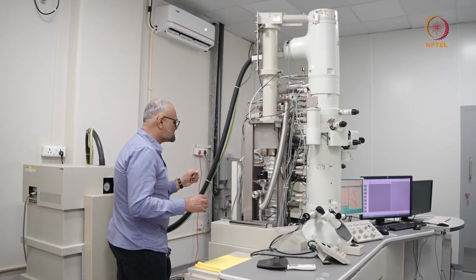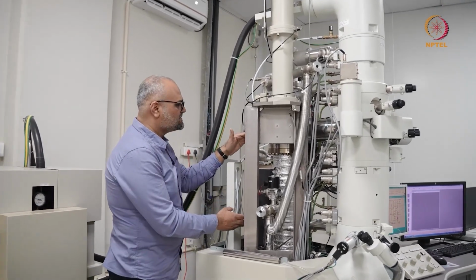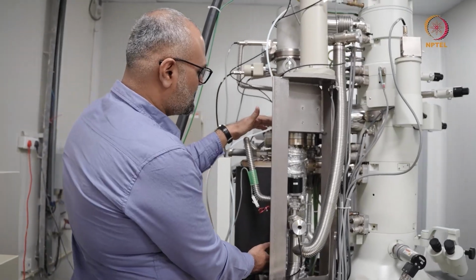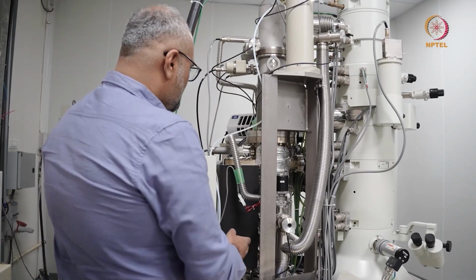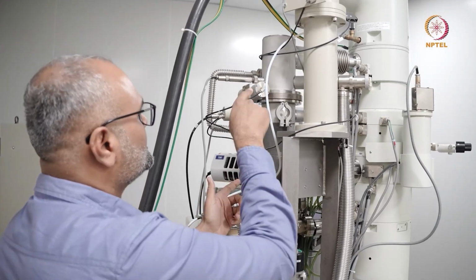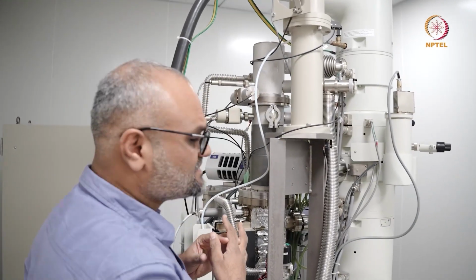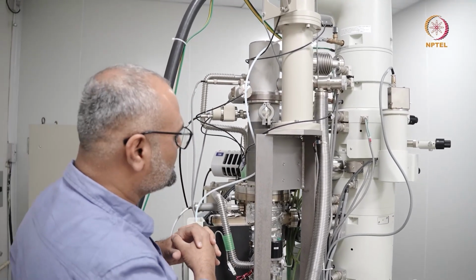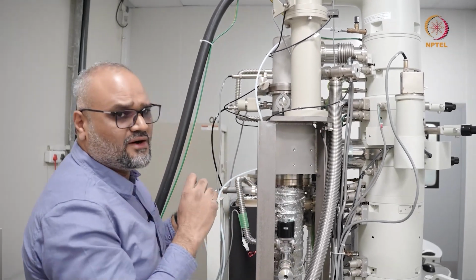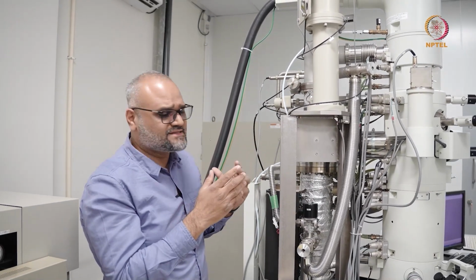If you come a little closer, what you see here is the oil diffusion pump at this portion, and right here it is connected to, in this particular instrument manufacturer, what you call a sputter ion pump. This has a 200 liter sputter ion pump, or the other manufacturer calls it the ion getter pump.